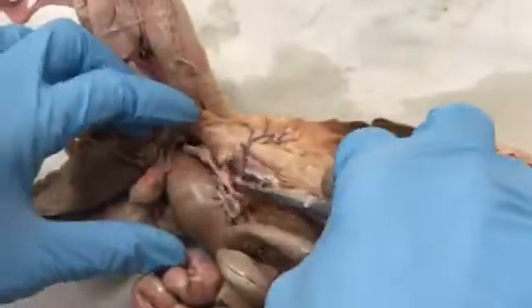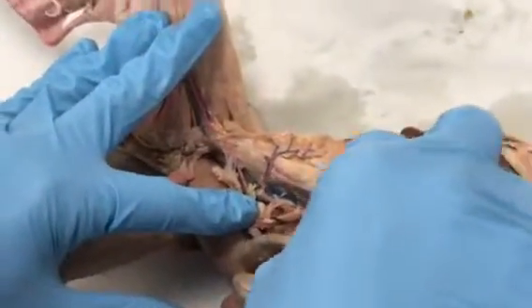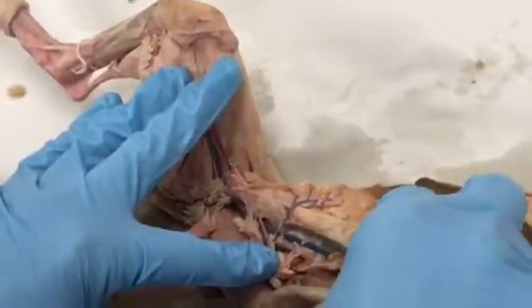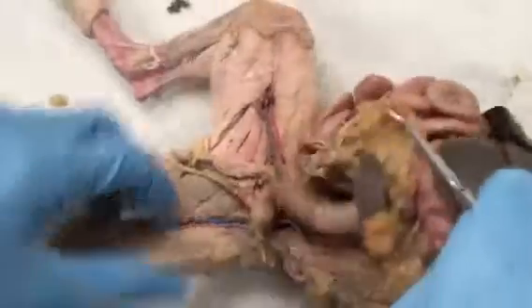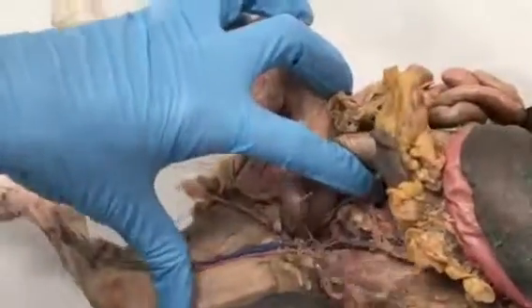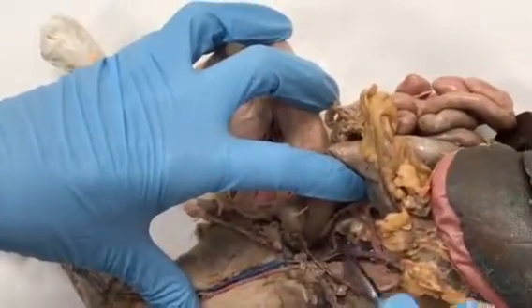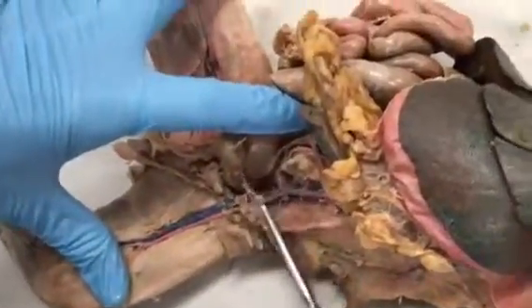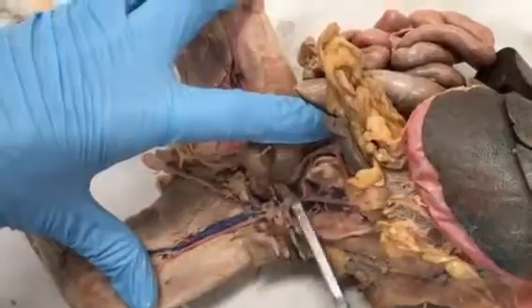Then we have the iliolumbar arteries, left and right. I'll go on the right side because they're intact on this side. This is the right iliolumbar artery. And then as the descending abdominal aorta continues, there's this first branching, this bifurcation, and we have the left external iliac artery.